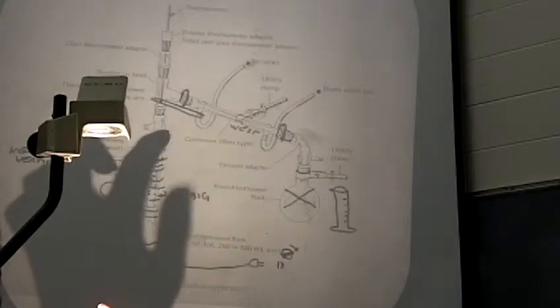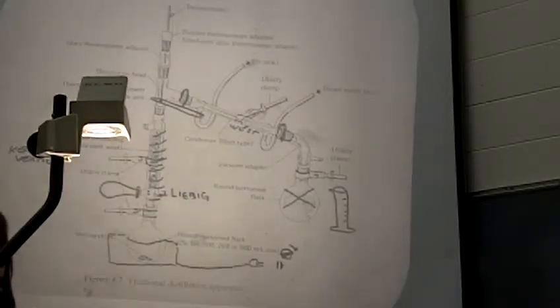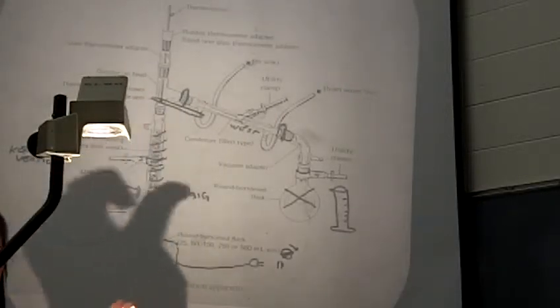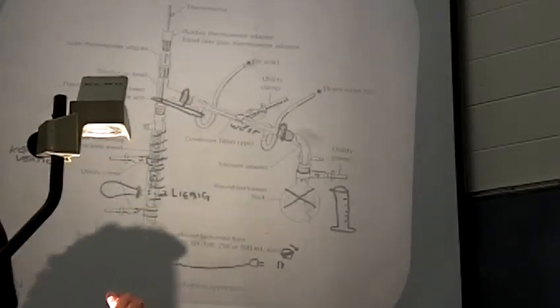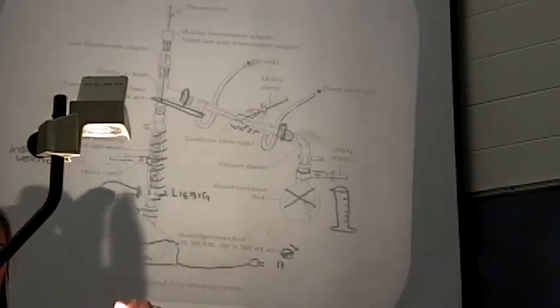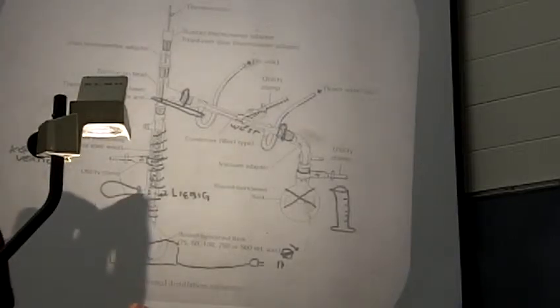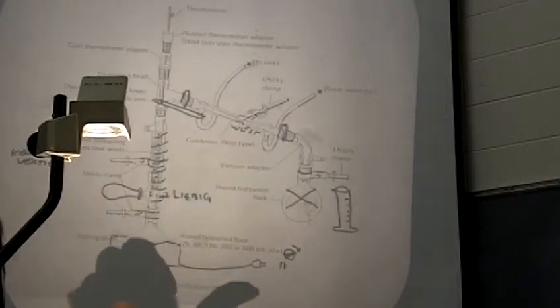Then you've got it clamped nice and vertically, and on either the bottom or the top, you're going to put your pipette bulb. The reason for that is we don't want any convection, we don't want any circulation of air going on in the condenser, because that's going to fight your fractional distillation as well, okay? So we want to stop that airflow by closing off one end. So you put your pipette bulb on one end, that'll take care of it. And it doesn't matter if it's the bottom or the top, okay?